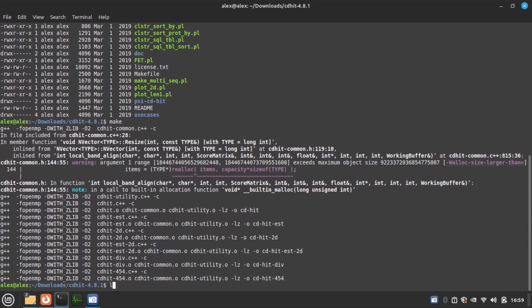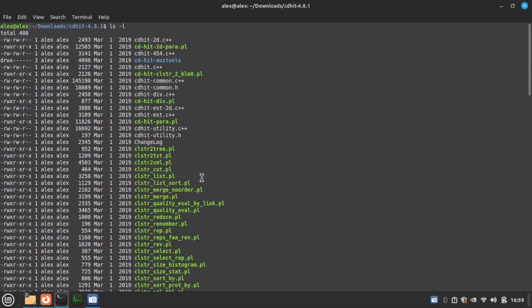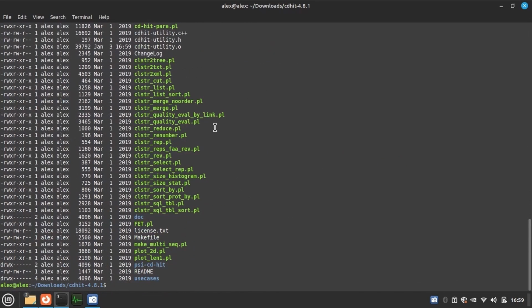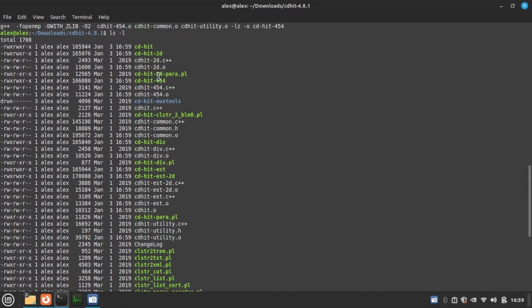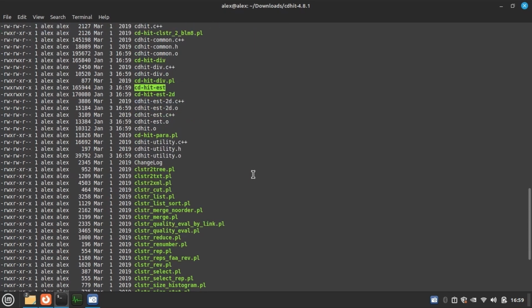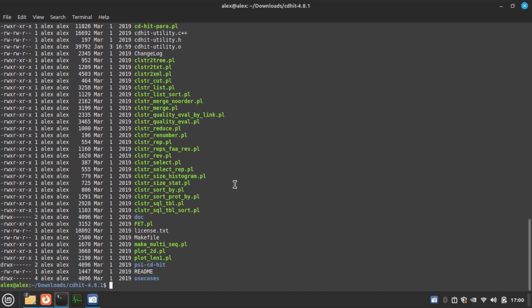Let's check the list again. So here you can see that cd-hit and cd-hit-est are in executable format.